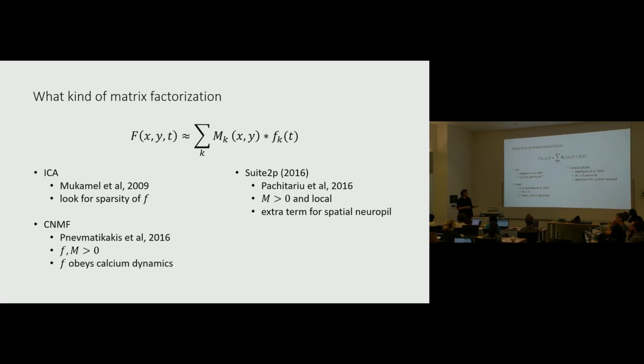It turned out in the end that that was almost as good as just high-pass filtering the data. Not super strongly like you saw in Carson's motion registration, just high-pass filtering it a little bit. We know what the spatial distance of the neuropil is, maybe like 100 microns or so. So we should just high-pass filter with 100 microns, and that will mostly get rid of the neuropil. And that's what we do here.